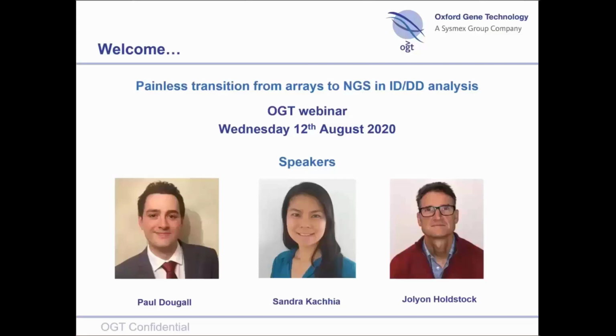Okay, thanks, Paul. One for Sandra here. Are there any suitable stopping points in the protocol? Yeah, that's a very good question. Yes, absolutely. After every process QC that we do, that is a stopping point. So you can split the protocol into much smaller chunks if you wish, and do it over a couple of weeks or whatever you need to fit in with your lab's requirements.